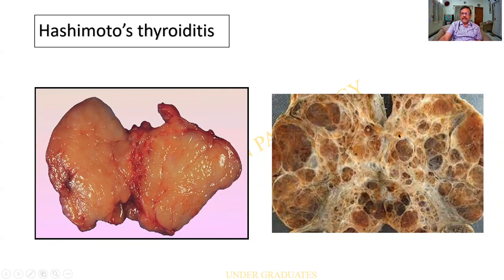On the contrary, this is also a thyroid that has been cut open. These gray-white broad lines are fibrous septae. In some areas they are thick. Still, I find some honeycombed appearance here and there. But then they are all divided into nests and groups, creating multiple nodules. So it is a multinodular goiter. Goiter is just an enlargement. It can be for various reasons. We shall go into the theory later.